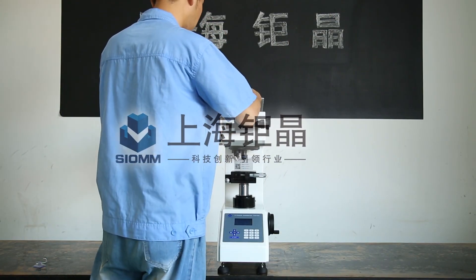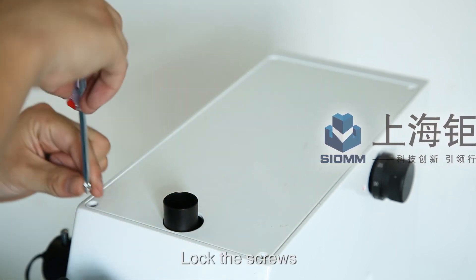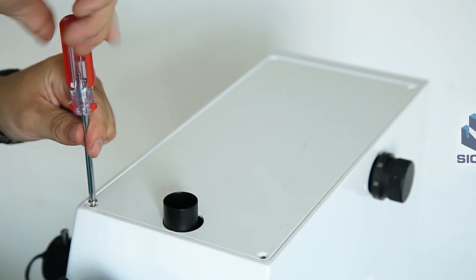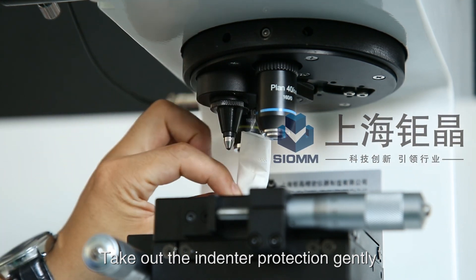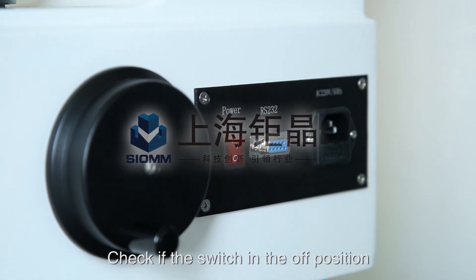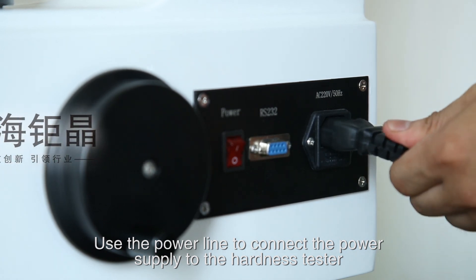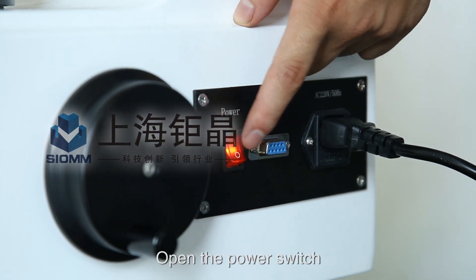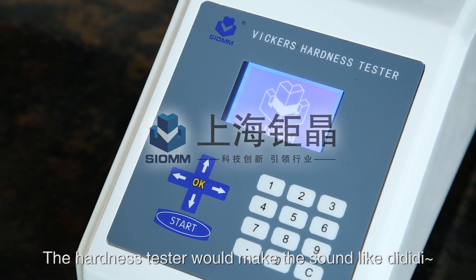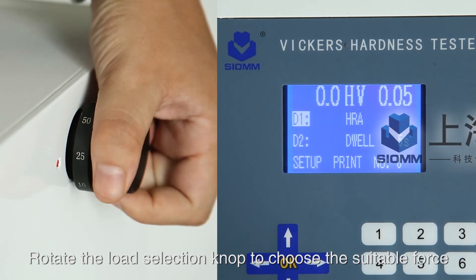Install the top cap and lock the screws. Take out the indenter protection gently. Check if the power switch is in the off position. Use the power line to connect the power supply to the Hardness Tester. Open the power switch — the Hardness Tester will make a startup sound and the main interface will show on the screen. Rotate the load selection knob to choose the suitable force; the selected force will show on the interface.